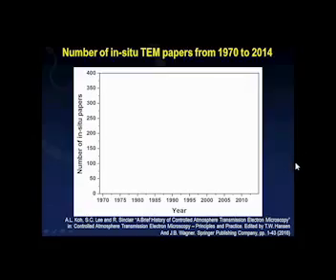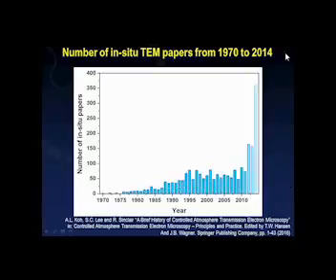In terms of future outlook, I started this presentation by showing the number of in-situ TEM papers published from 1970 to 2012. So let's look at what has happened since 2012. So the first slide with the statistic of 2012 ended here, and these are the number of in-situ publications in the year 2013 and 2014.